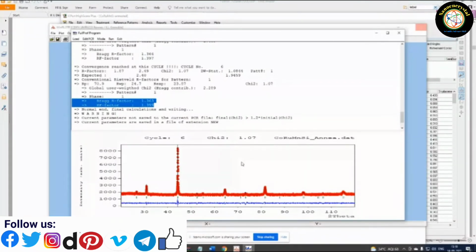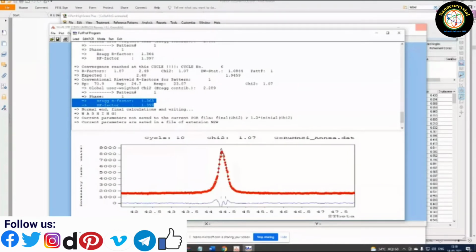Here we are not focused on the peak intensity value. We are not interested in any difference between the peak intensities. What we are interested in is the peak positions. Remember that 2d sin theta equal to n lambda gives the reflection positions, where your reflections are happening. But we are not focused on the structure factor, because the structure factor gives the intensity.